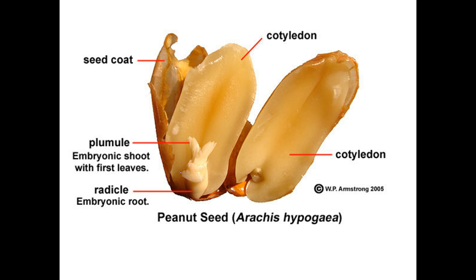A carrot, that's just the root of a plant. There's no reason for it to have high lipids. A sunflower seed, again, it has a seedling, so we expect tons of lipids. Spinach, which is just the leaves of a plant, we don't expect to have a lot of lipids. And then E and F, a coconut and an almond, both of those are nuts or are seeds. So again, they're going to have a developing embryo that they are supplying, so we expect them to have high lipids.